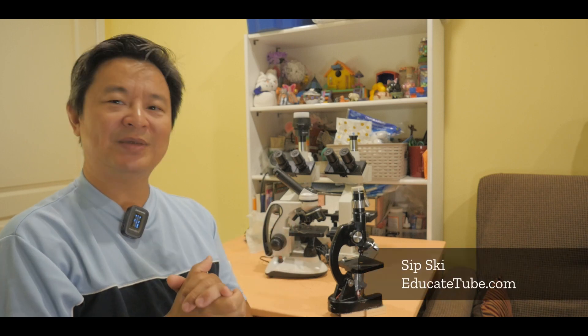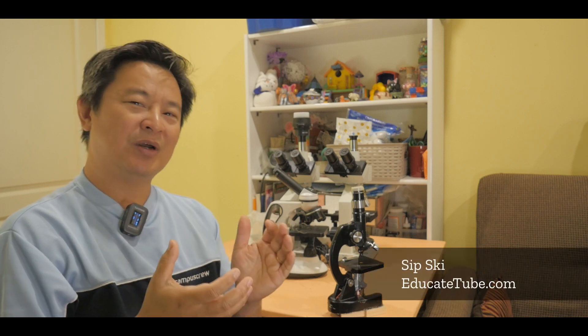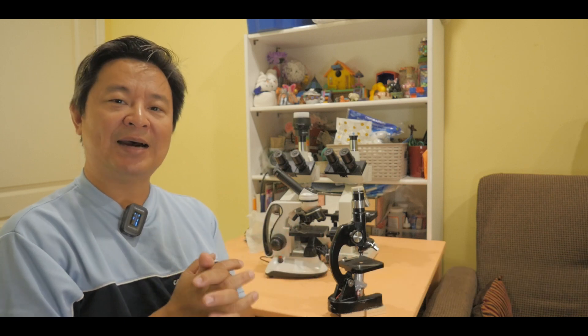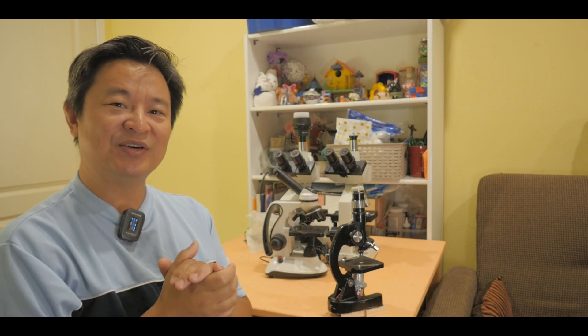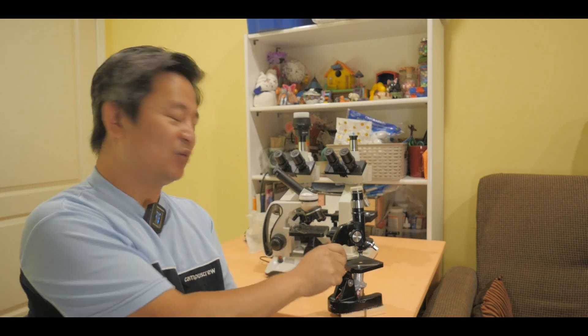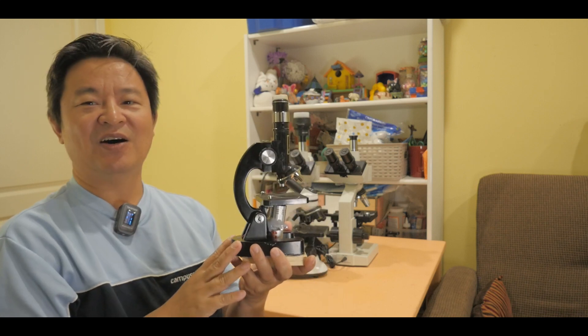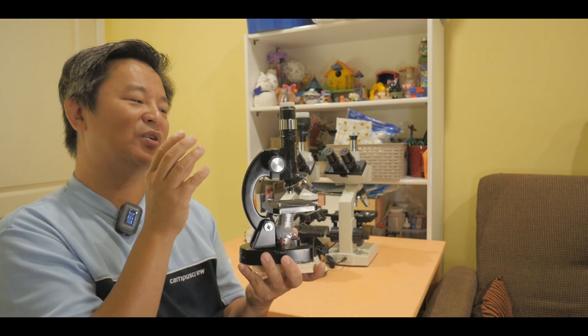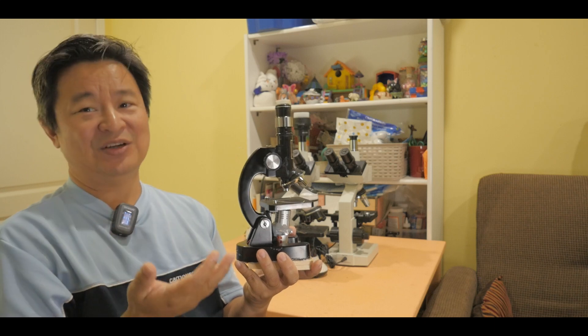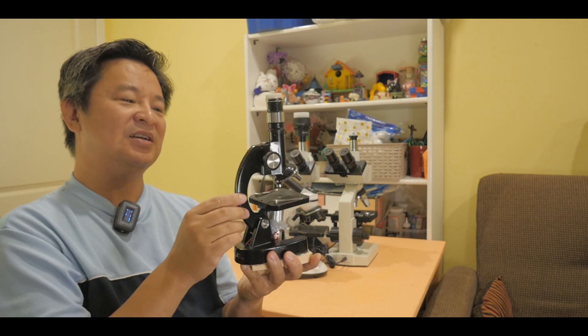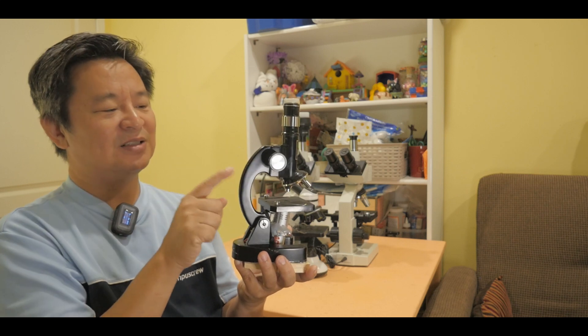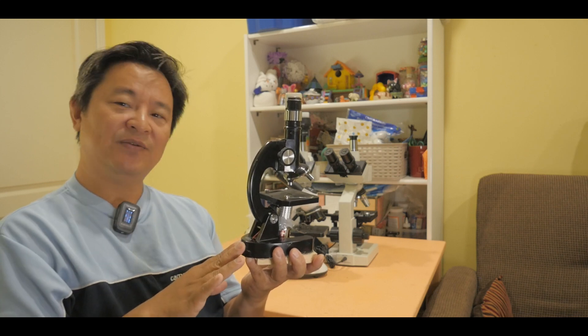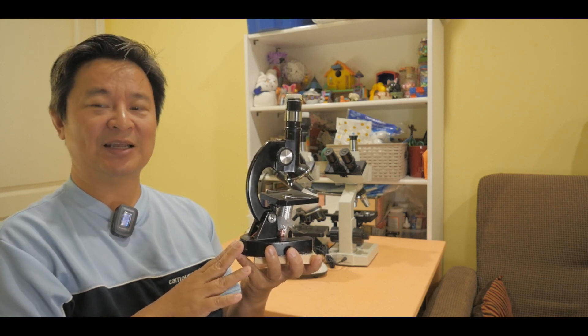So you want to purchase a microscope that is decent and you don't want to break the bank either. Somewhere between 100 to 400 dollars is reasonable for a good lab microscope. Now the one thing I would first consider is the one that you want to avoid which is this one here. I know there's tons of these online and in stores and this is the one that you don't want to purchase. Now this particular student or kids microscope generally is not very good. Very small as you can see here. In addition, most of them are made of plastic. Thank goodness this one is actually made of metal but still I would not consider buying it if I had to buy it again. Even though it's around 40-50 bucks I would still avoid paying for that type of price.